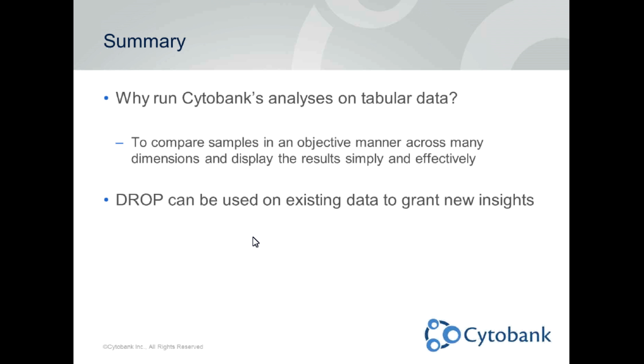So this, I think, is a valuable point to mention: you don't have to say, oh well, you can run it on only new data. If you have 5-color data from your imaging core 10 years ago, you can go back, look at that data, convert it, and run VISNE on it in Cytobank. So definitely the sky's the limit when it comes to how you can apply this. And hopefully today has given you a little taste of how that might work.